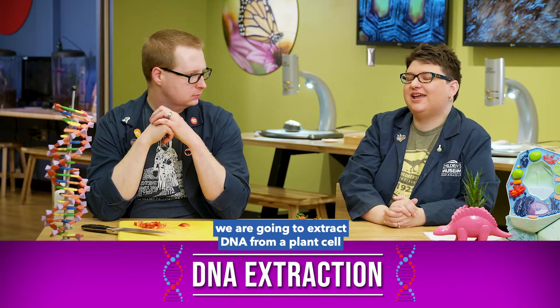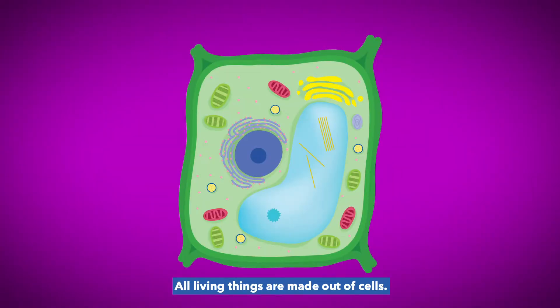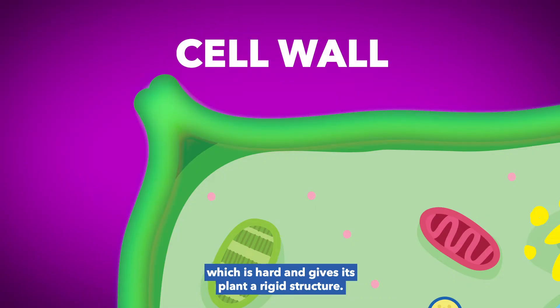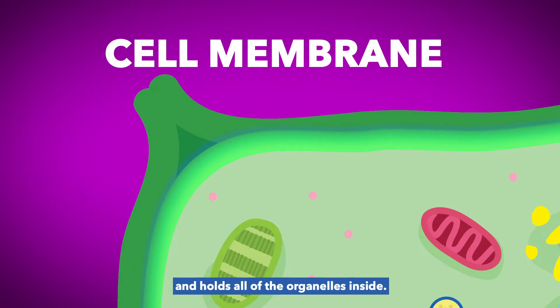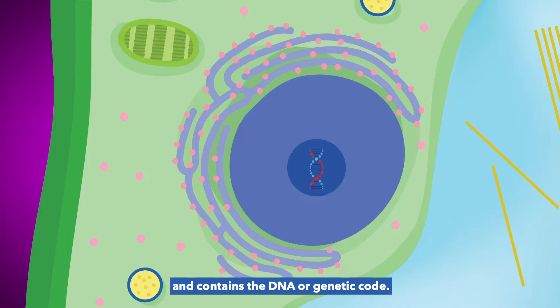We are in the STEM lab at the Children's Museum of Indianapolis. And today on Real Science, we are going to extract DNA from a plant cell. But first, let's talk a little bit about cells and their organelles. All living things are made out of cells. Inside the cells are organelles — parts of the cell with specific jobs. The outermost organelle is the cell wall, which is hard and gives the plant a rigid structure. The cell membrane is just underneath the cell wall and holds all of the organelles inside. The other organelle we're going to talk about is the nucleus — it is the control center of the cell and contains the DNA, or genetic code.